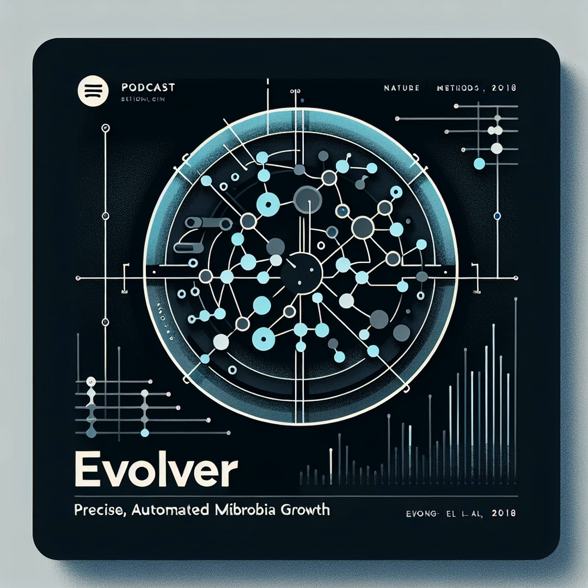Precisely. And tying it all together is the control system based around Arduino microcontrollers and a Raspberry Pi. This handles the data acquisition, processing, and feedback control, allowing for real-time adjustments to the culture conditions based on the sensors in the smart sleeves. Everything is orchestrated via Python scripts, which means the experimental parameters are entirely user-defined. This programmable nature of the system is a real strength.